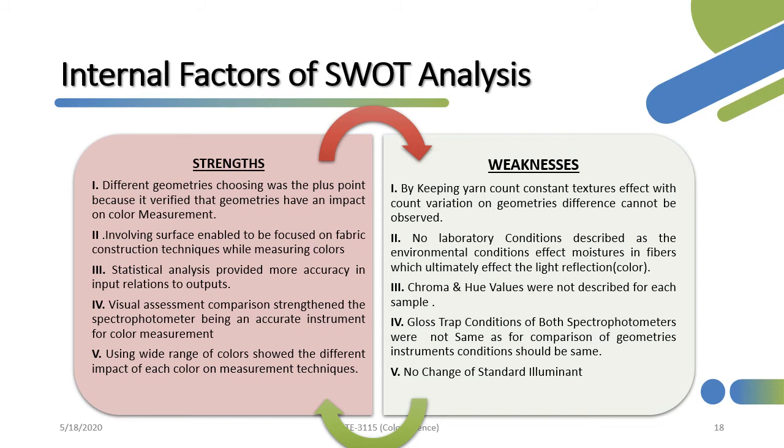The second plus point was that the author involved different types of fabric textures manufactured of the same color, because in our daily life we often observe that two persons wearing the same color fabric but with different textures, the fabric is showing a different shade. While the third plus point was that the author used statistical analysis to observe the effect of input factors on the output obtained. It happens in most of our laboratory experiments that we predetermine that this factor will affect the output, and in our conclusion we write blindly that it is affecting our output, but sometimes in the statistical analysis that factor hadn't any effect on the output. So statistical analysis involving was a plus point.